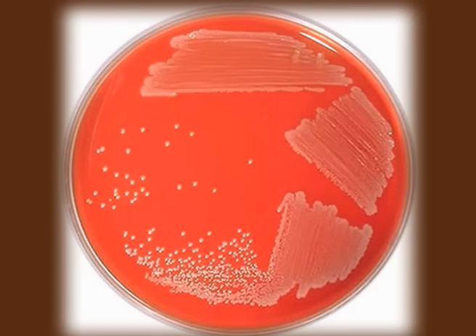While the other species of Staphylococcus, that is Staphylococcus epidermidis, will produce no color change as it is unable to utilize mannitol and thus unable to do fermentation process, and is not producing acid, which will produce the change in the color of the indicator. The other group of differential medium are blood agar. Blood agar means the blood is added to the medium to make it more specific.